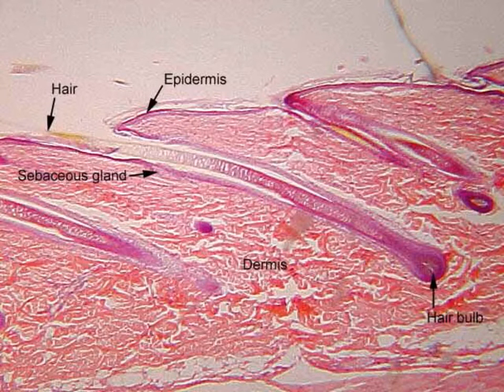Here we have a little broader view of the same slide, a long section of the skin and hair. Again, we can see the hair. Above it would be the shaft and below it would be the root. The enlarged area that we have at the tip is the papilla of the bulb. We have the hair follicle on each side. We can see that we are in the dermal area.